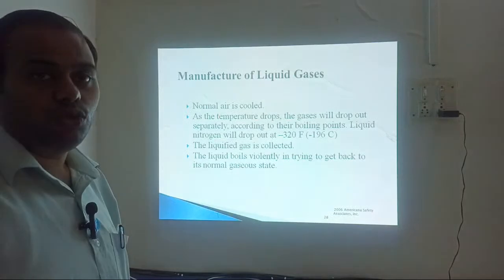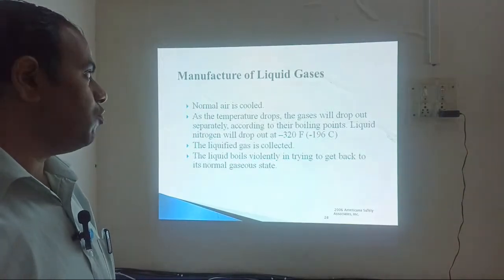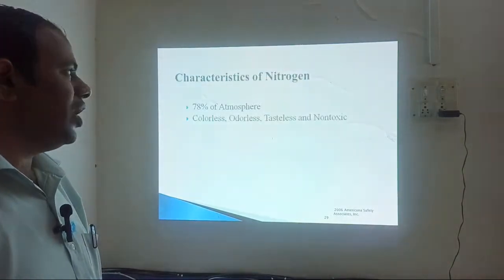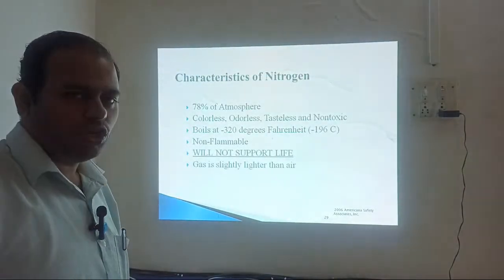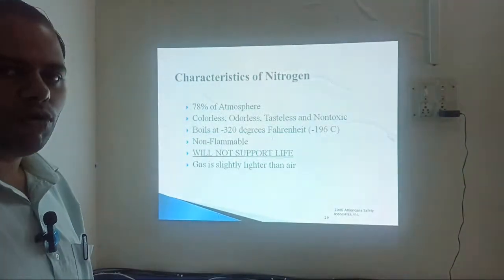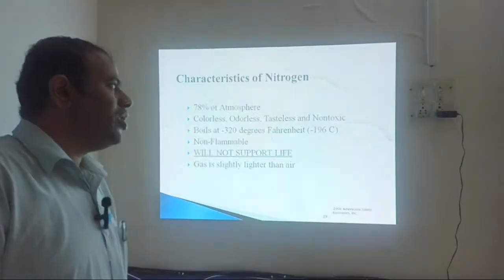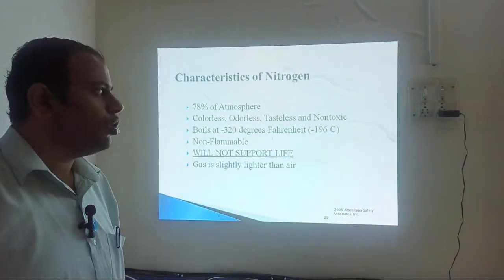So here remember, the liquid boils violently to get back into its original gaseous state. So you have to be very careful while handling this. Okay, so let's see what are the characteristics of nitrogen. First of all, obviously you know that it is about 78% of the atmospheric composition. It is a colorless, odorless, tasteless, and non-toxic gas.